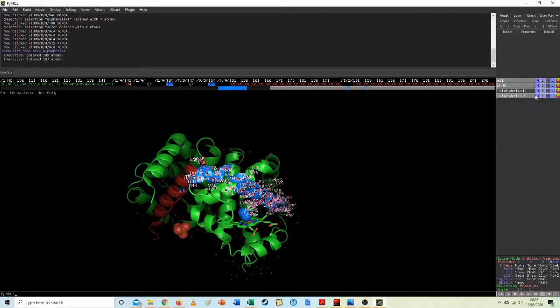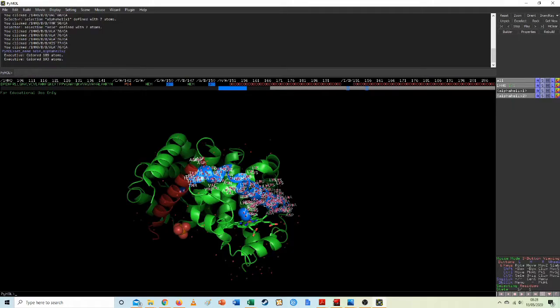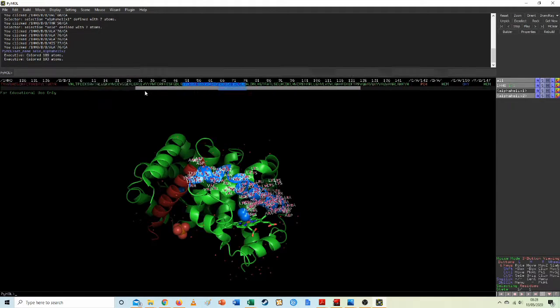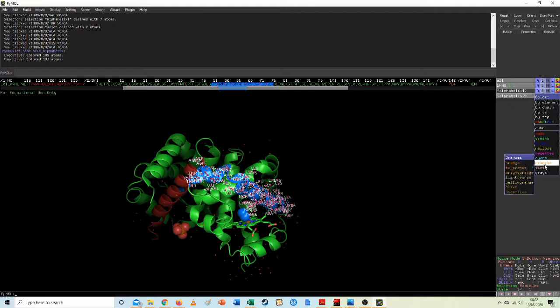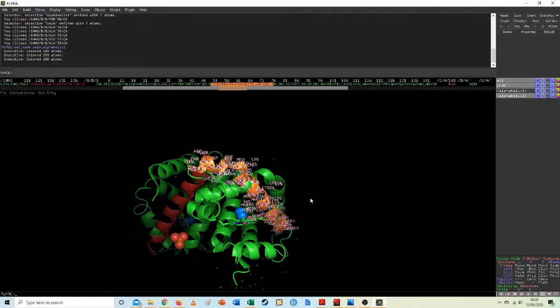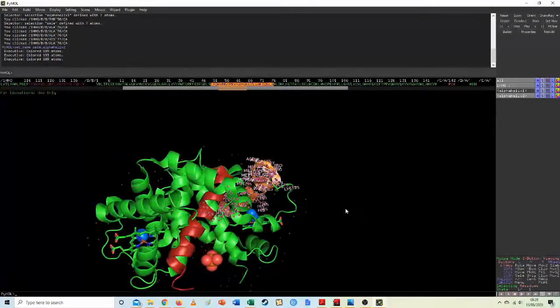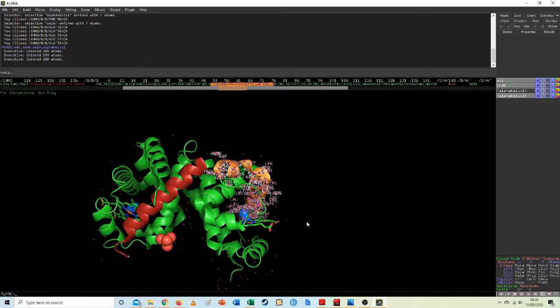No, go back, edit, undo. No, it's not undoing it. Oh dear. Okay, I'll deselect these. We'll go back to this guy, and we will colour. What did we go for? TV orange. There we go. Now our oxygens are blue, and we can see that this hemoglobin can carry those oxygens like that.